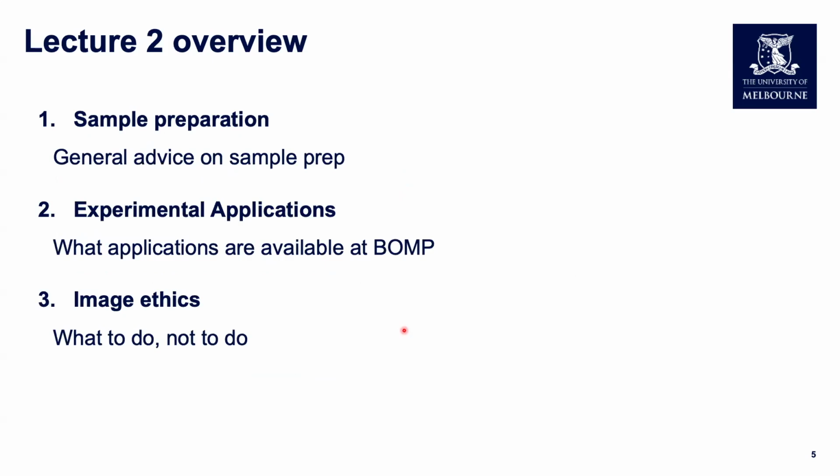Okay, so today's talk will cover some general advice on sample preparation. This is probably far too specific for individual projects to really get into too much depth and detail, but we'll give some higher level advice on sample preparation. As I say, we'll then spend the majority of the time going through experimental applications, and we'll focus primarily on those that are available at the microscopy platform here at the University of Melbourne. I realize that's not all applications that are available, but that will certainly give you a fairly decent understanding of the majority.